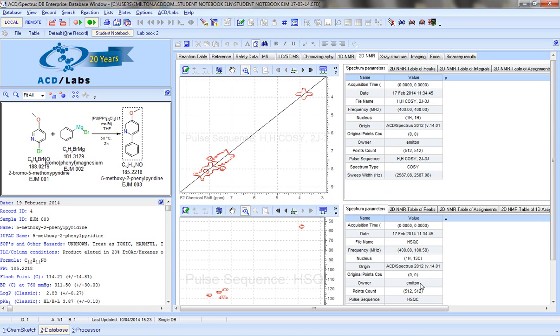Here we can see 2D NMR files, HSQC and a COSY in this case, again with the data tables generated from Spectrus Processor.